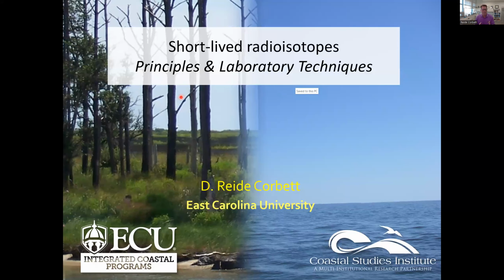Hello, my name is Reide Corbett, and I'm going to talk to you today about short-lived radioisotopes, their principles primarily, and some of the laboratory techniques to get you some of those results.